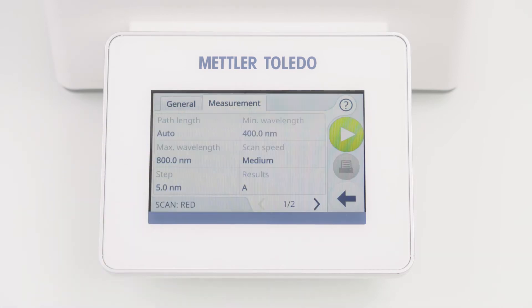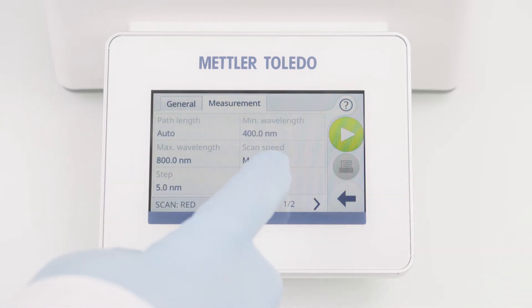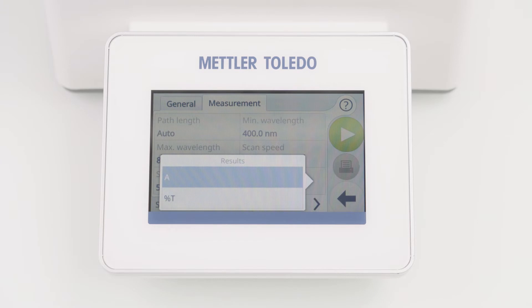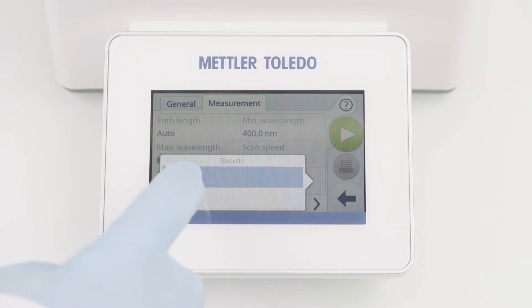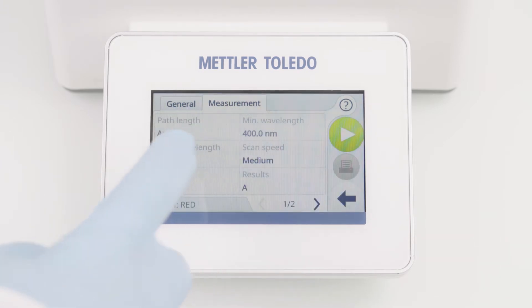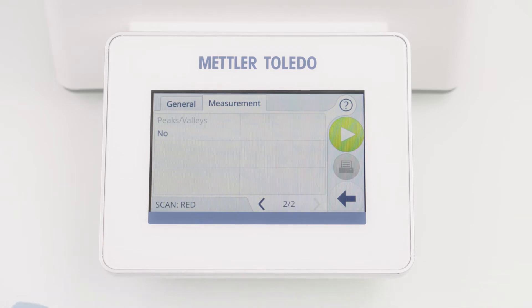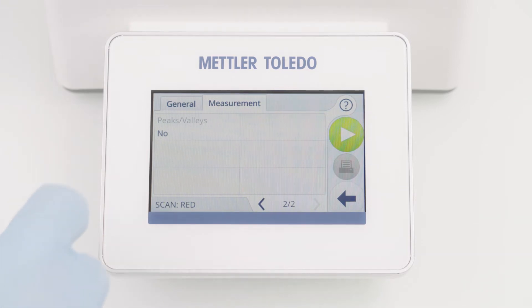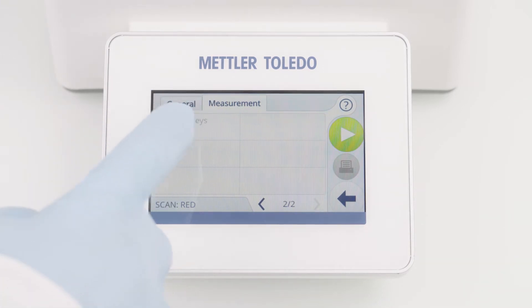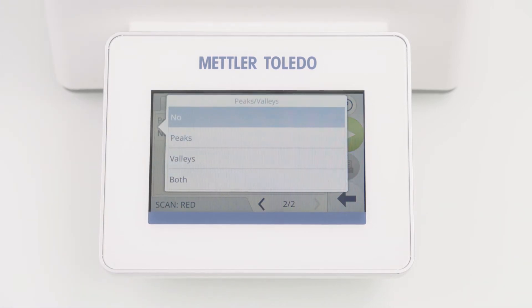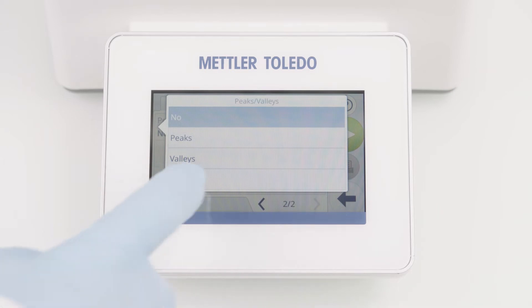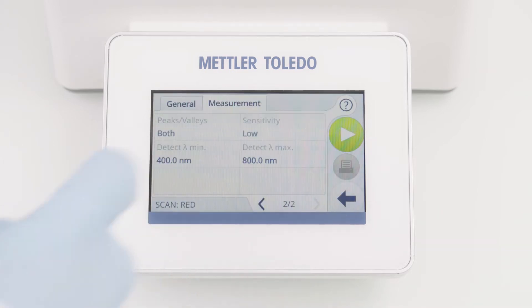You can also select the result of interest: absorbance or transmittance. And last but not least, I can activate the peak and valley detection and adjust the sensitivity and the wavelength range.